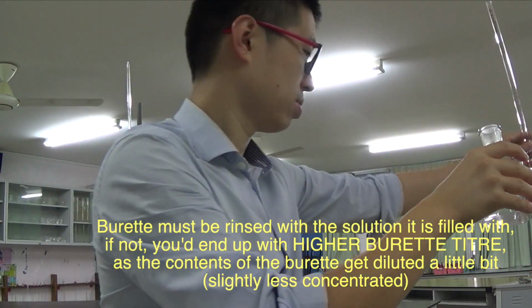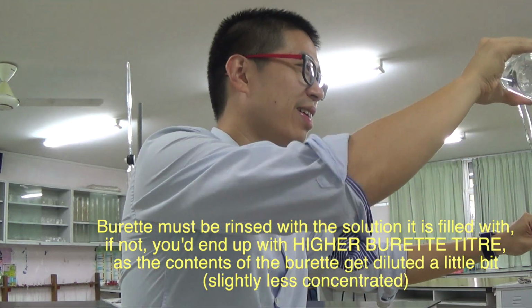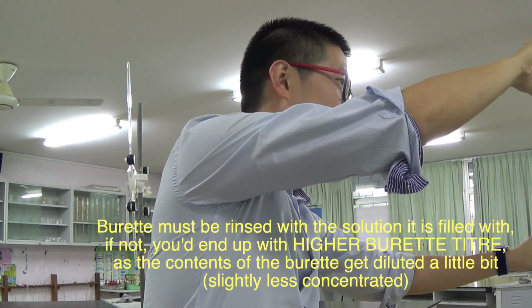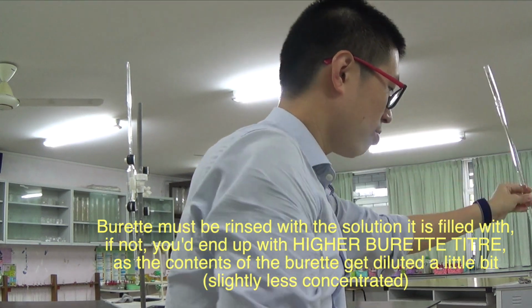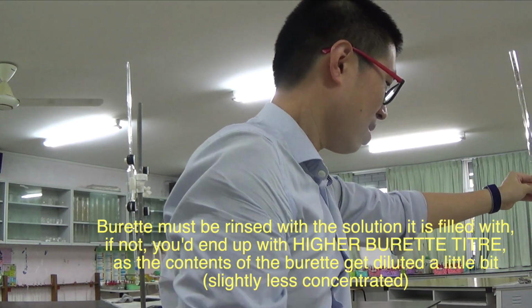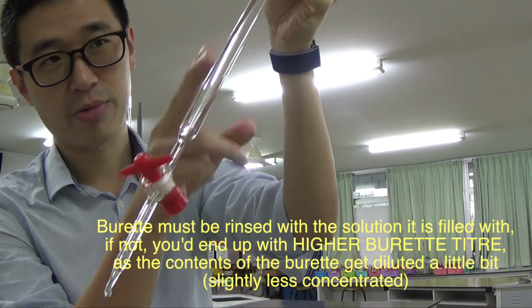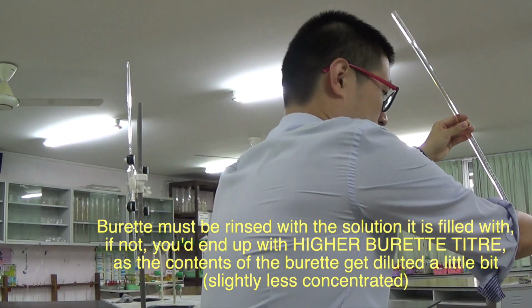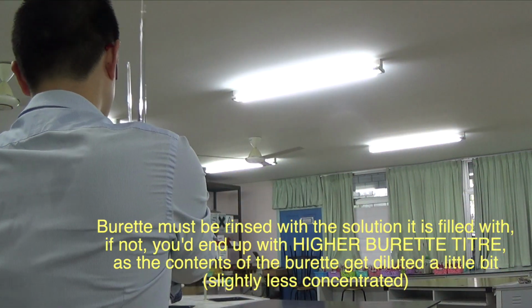Oops. Avoid filling it on the floor because you might make the same mistake as me. Okay, so what we need to do is open the tap so that the solution I'm filling in right now will fill up the bottom bit as well. So that much is filled already. So I can just put this up here.